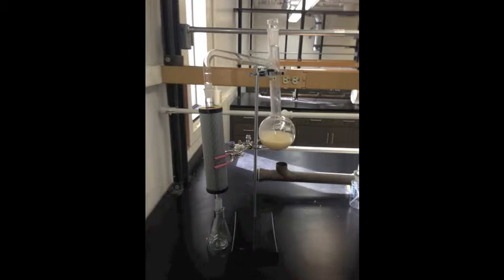This video will outline materials required and the procedures to be followed when conducting a simple ethanol distillation. Let's first begin with a bit of background.